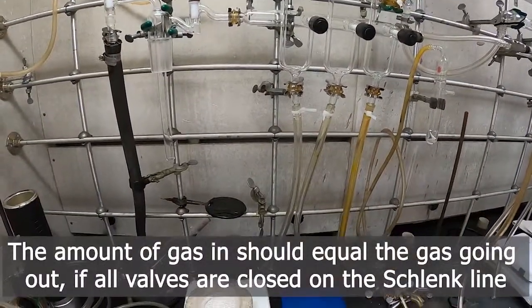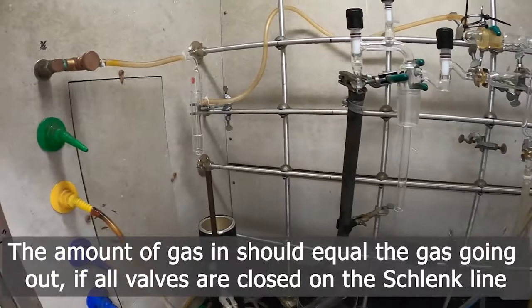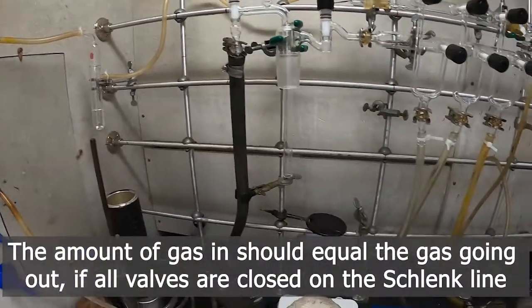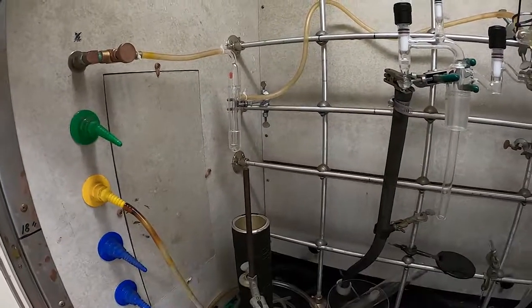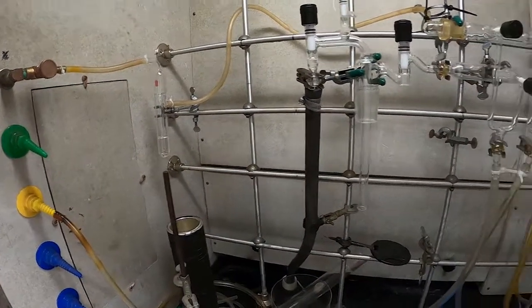And it's important that the in rate is equal to the out rate. Otherwise, you know that you're building pressure somewhere or the system is leaking and you need to shut a valve off or address the leak.